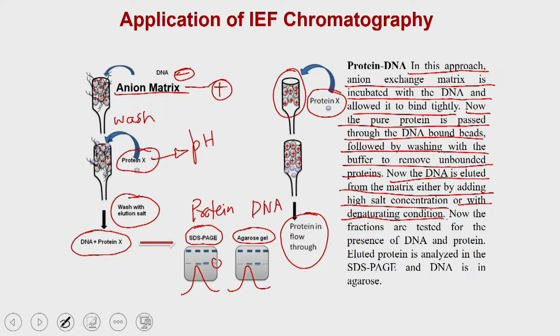Now, you can collect the fractions, and these fractions can be tested for the presence of DNA on the agarose gel and the protein on the SDS-PAGE. The eluted protein is analyzed on the SDS-PAGE and the DNA on the agarose gel, and that is what we have said.